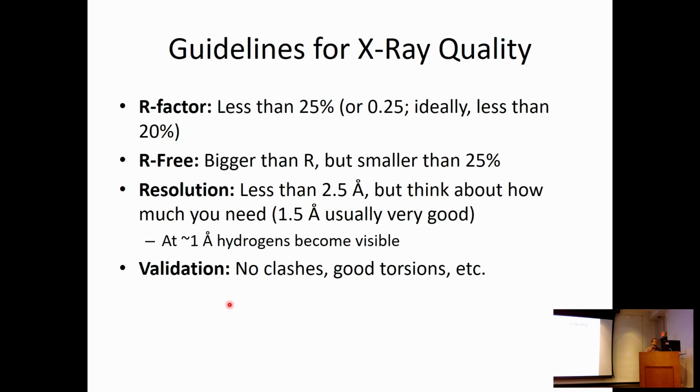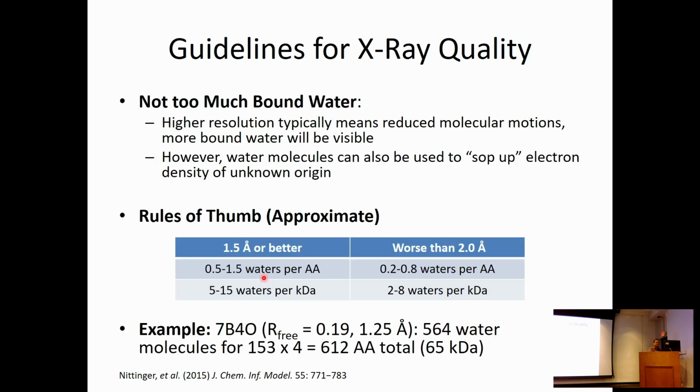And then finally, there's some other stuff that the PDB tells you, as far as validation of the structure. They'll tell you if there's steric clash. They'll tell you if the Ramachandran plot looks like it should. So things like that. And we'll look specifically at how these work.